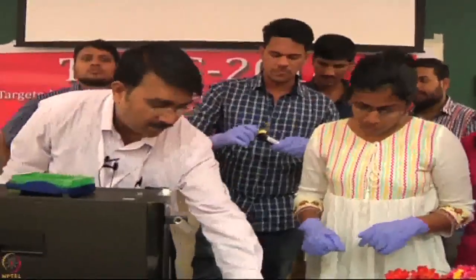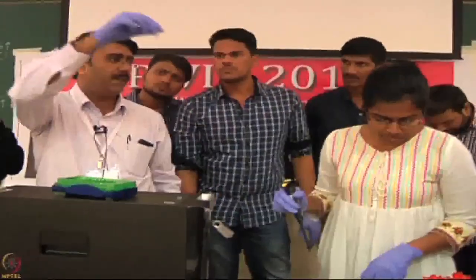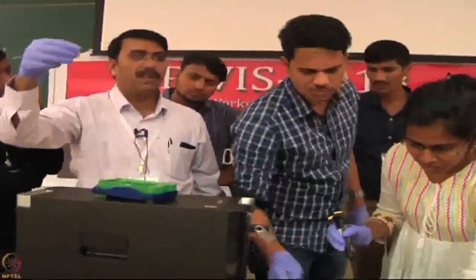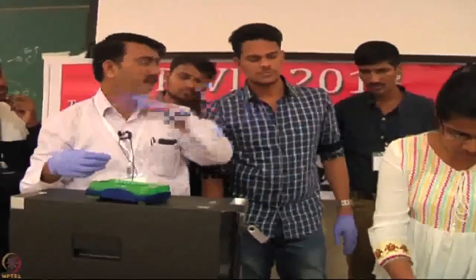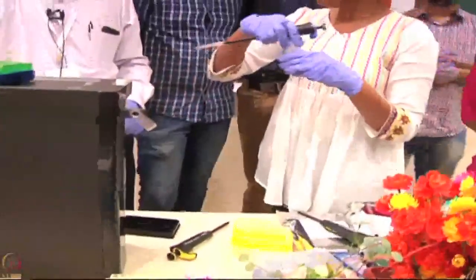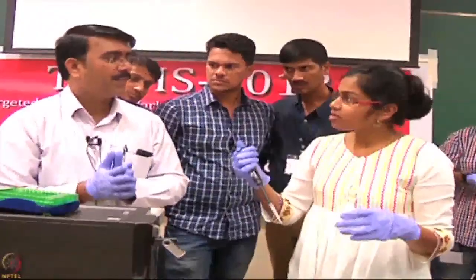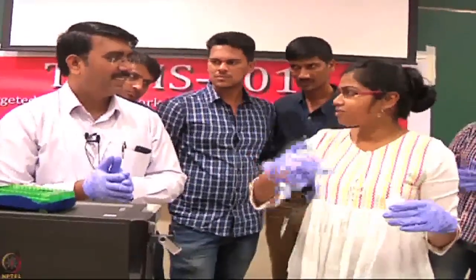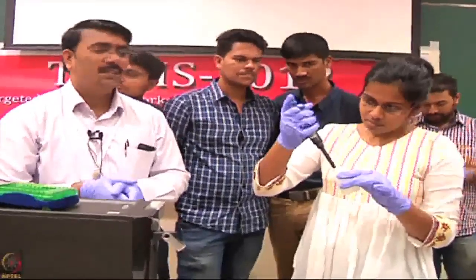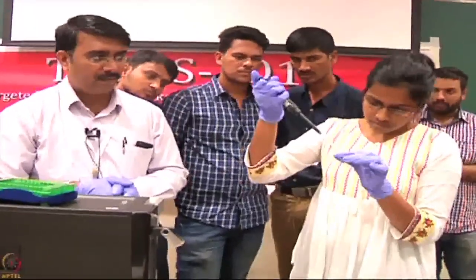And I have the mouse antibody, it is 1 mg per ml. I have 20 microliter here. Then take 10 microliter, this corresponds to 10 microgram. It's nothing but 1.5 ml of this, and 15 microliter of sample, meaning 1485 microliter plus 15 of that. Let's see, this corresponds to 1.2 microgram per ml of the biotinylated protein.